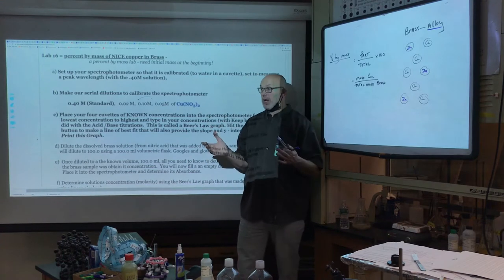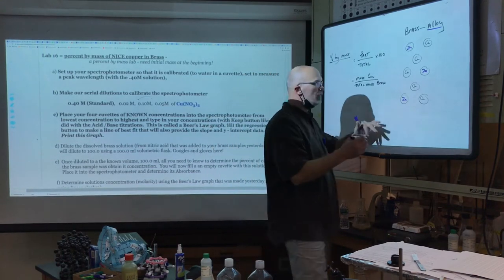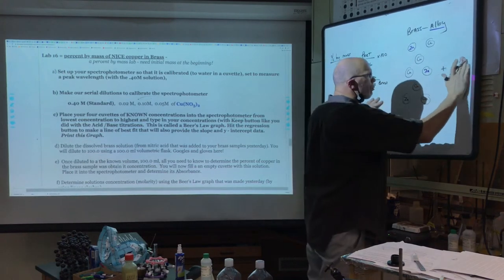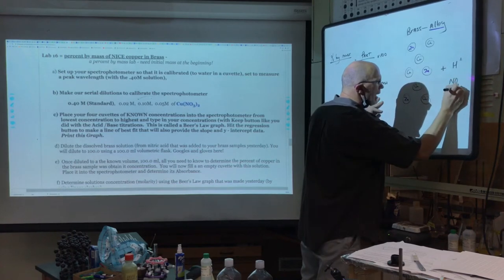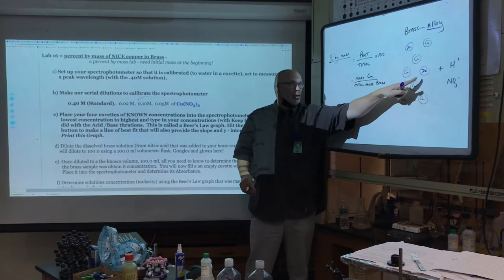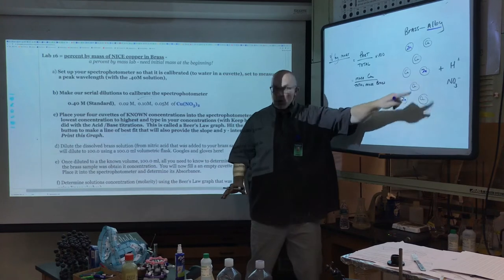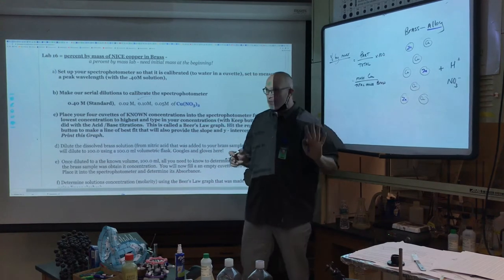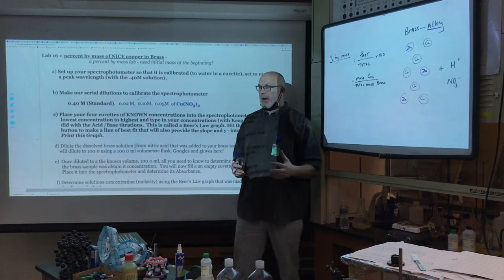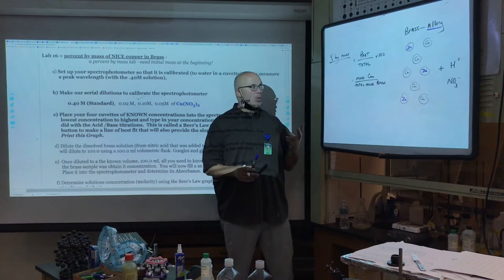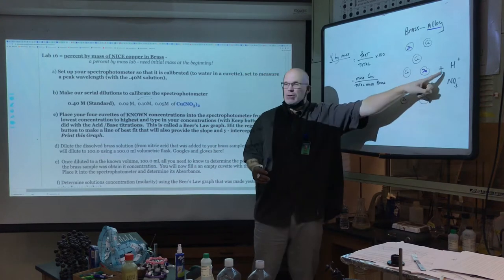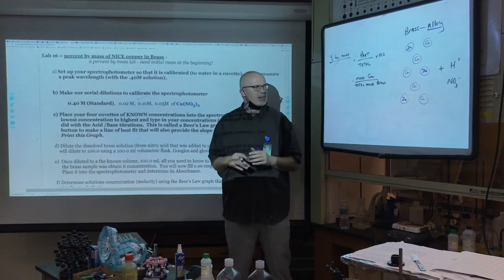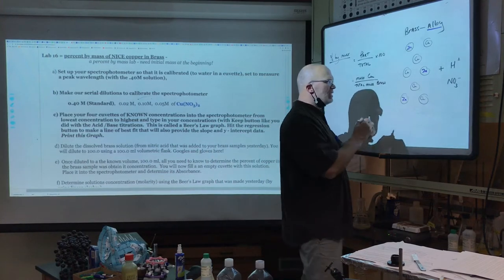To extract the copper, we're going to use spectrophotometry. First, I'm going to add nitric acid, HNO₃. It's a strong acid, so we're really adding protons and the nitrate ion. The protons are a strong enough oxidizing agent to make zinc go to Zn²⁺, but not strong enough to oxidize copper to Cu²⁺. If we just used H⁺, we'd dissolve the zinc on the outside but not reach the copper inside — and the solution would be colorless, making spectrophotometry impossible.